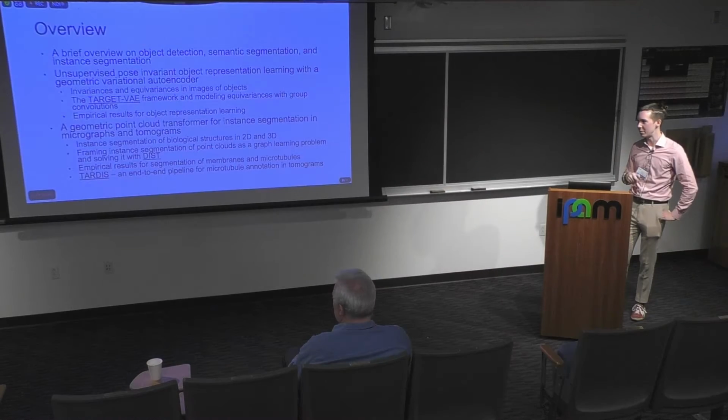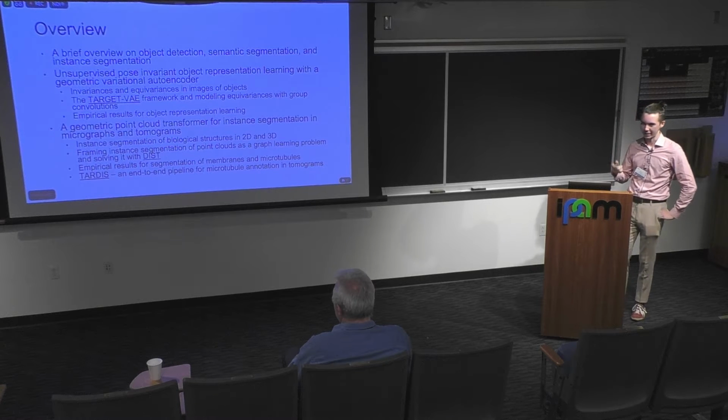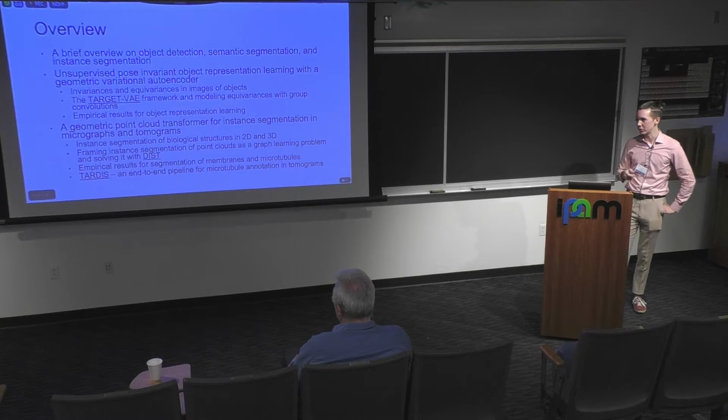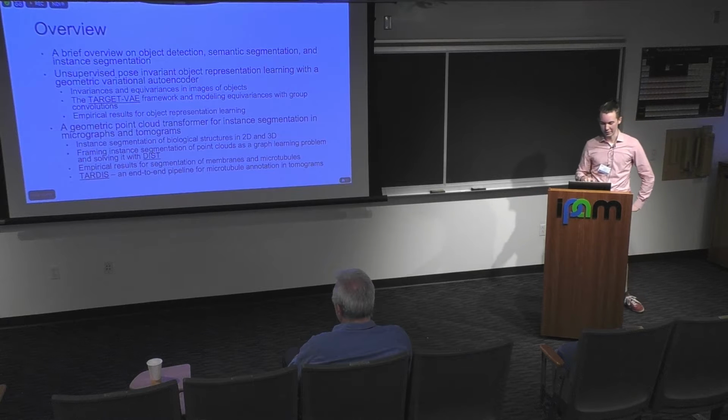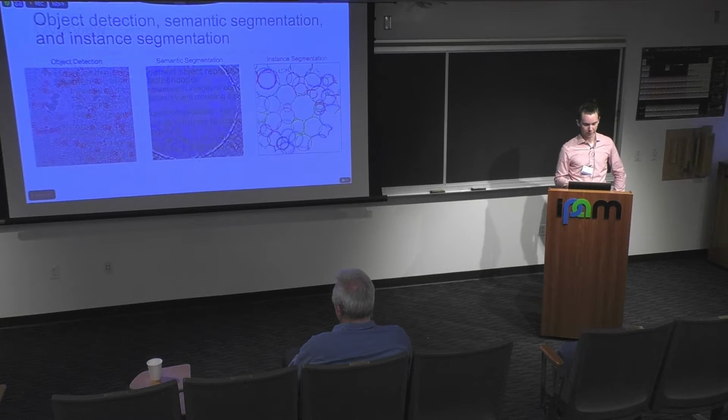So we frame this problem as a graph learning problem, and we train a neural network to do inference on this, taking point clouds as inputs. I'll show you some empirical results there, and then I'll show you our end-to-end pipeline for microtubule annotation in tomograms that also combines this with a semantic segmentation network.